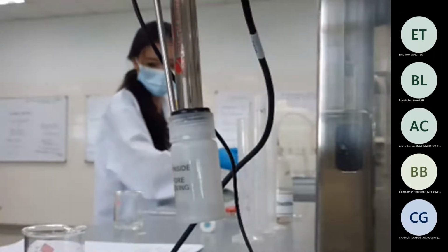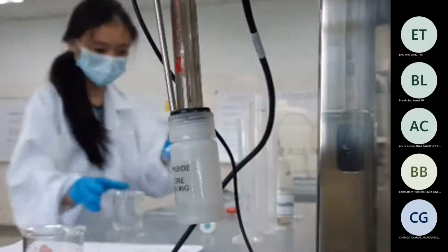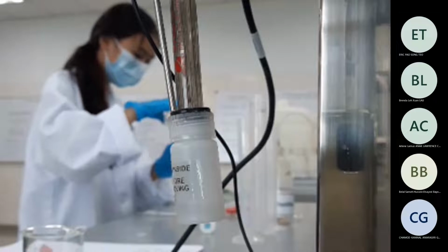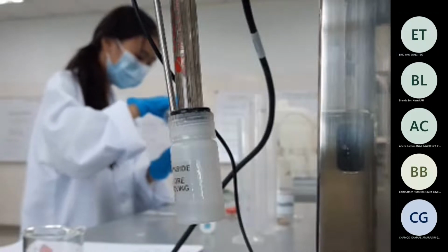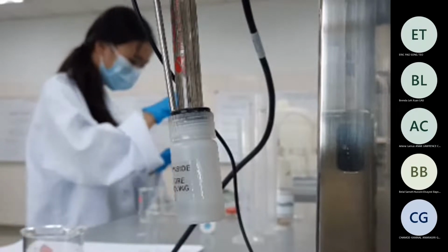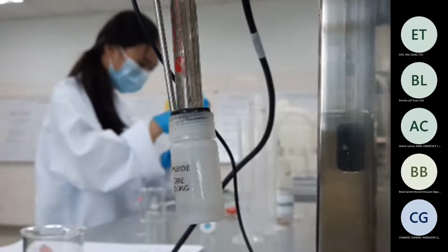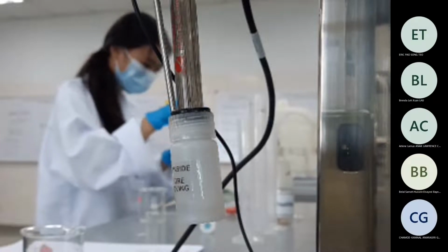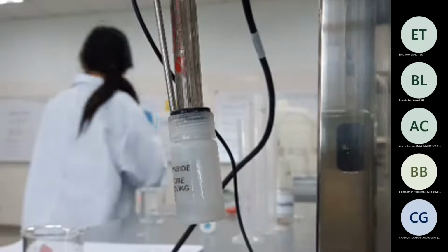Okay, so in that white box. Yeah. So these 3 droppers I'm giving to 3 of you. You need to wash the dropper first with distilled water. Here you fill it up, then fill until here with the water, and then use the dropper to drop.